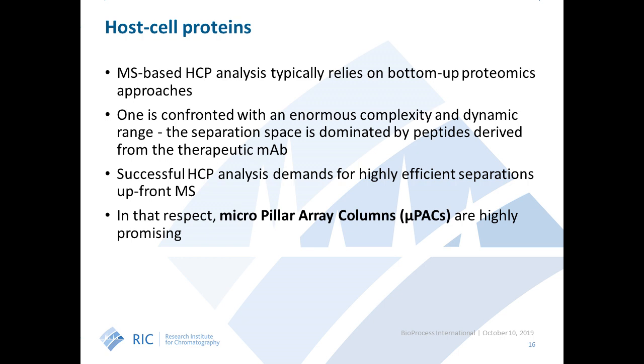Now, if we want to successfully analyze these host cell proteins, we really need highly efficient separations upfront of mass spectrometry. And in that respect, the micropillar array columns are extremely promising. And as just discussed by Geert, due to the order that exists in these columns, the peak dispersion can really be minimized, and highly efficient separations are the result of that. And this really allows for in-depth host cell protein monitoring.